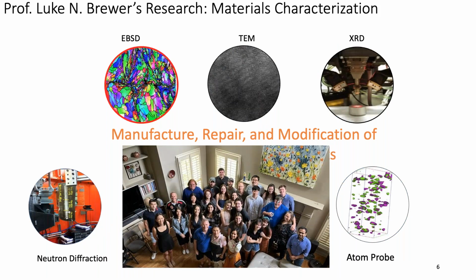I have a deep and abiding interest in materials characterization. And I mean, you can't make new things and not look at them very closely to see, well, how did they change? And so I've had the opportunity to work with a number of characterization techniques over the years, including electron microscopies, both at the micro and nano scale. I've also used quite a bit of X-ray and neutron diffraction. We'll talk some more about that later today. And more recently, I've gotten involved in atom probe tomography.